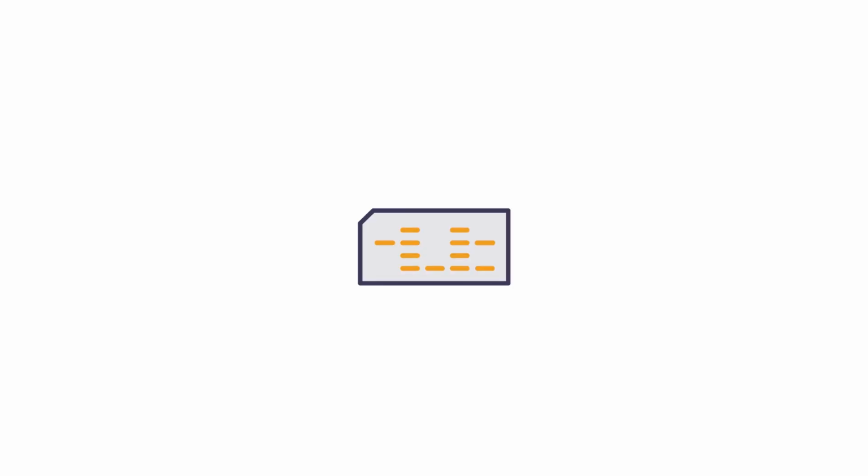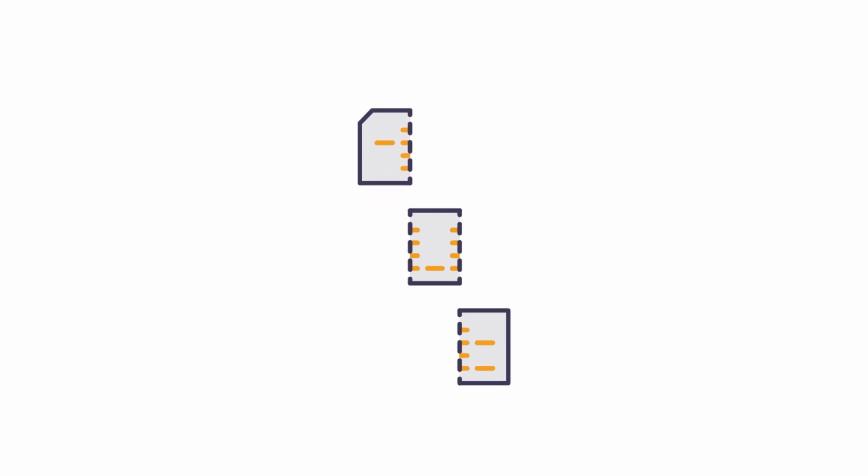In either case, however, you will first need to check for cross-reactivity between your primary antibodies to ensure that this does not affect your results. If you have two primary antibodies, A and B, a simple test is to run a couple of samples in triplicate, with a visible molecular weight marker in between. You can then cut the blot vertically in 3, following the lines of the marker lanes.